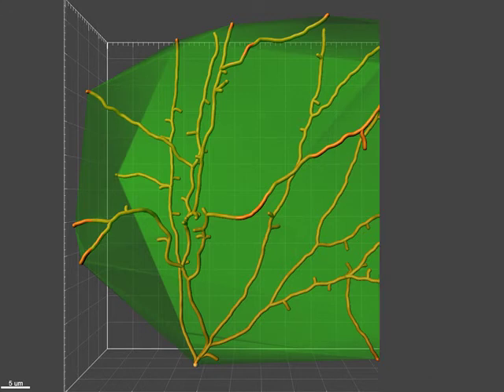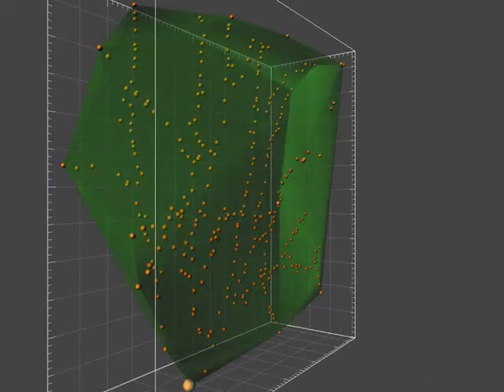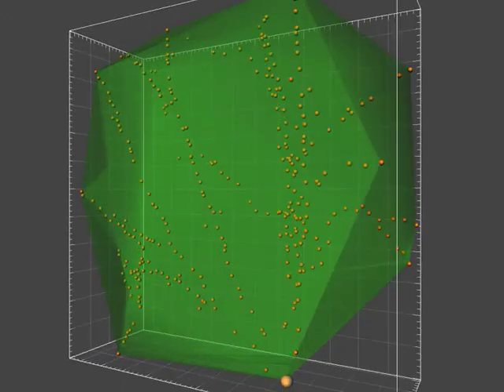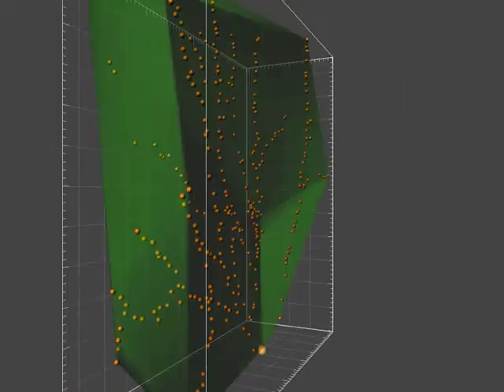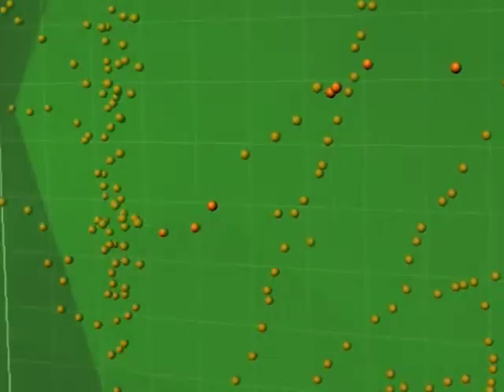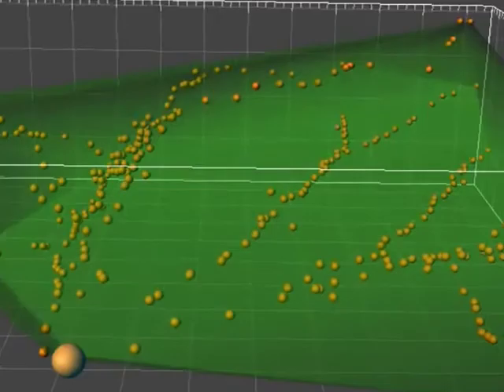In 2D images with a planar set of points, the convex hull can be thought of as a rubber band wrapped tightly around the points that define the selection. In 3D, the convex hull is the minimal convex polyhedron that envelops all distal points of the selected filament object.